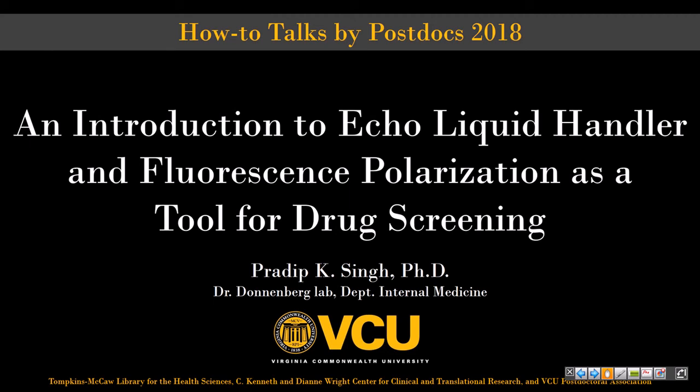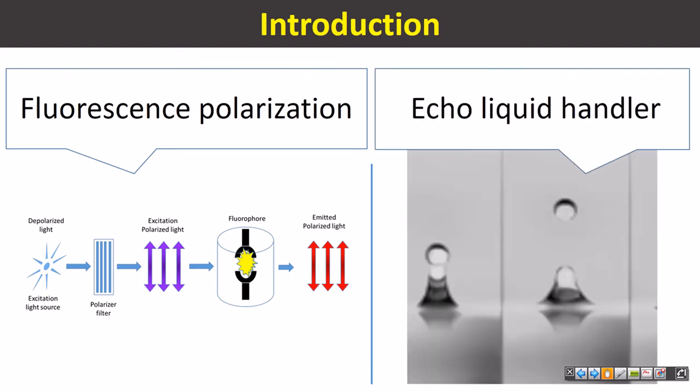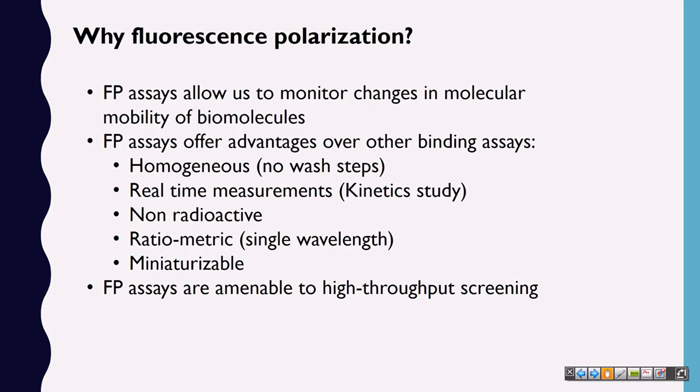Welcome everyone. Today I'm going to talk about the liquid handling system called the Echo liquid handler and the fluorescence polarization technique for drug screening. My talk is divided into 2 parts. First, I will talk about the basic principle of fluorescence polarization and how it works, and then I will cover the Echo liquid handling system. So let's begin with fluorescence polarization.